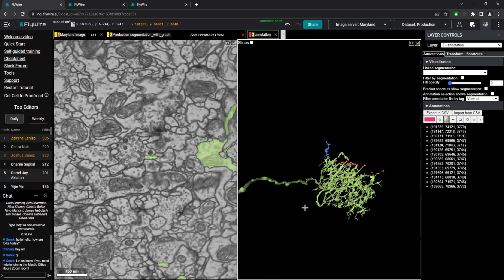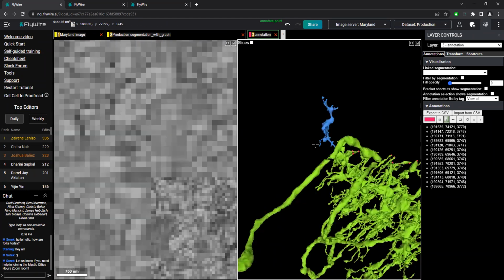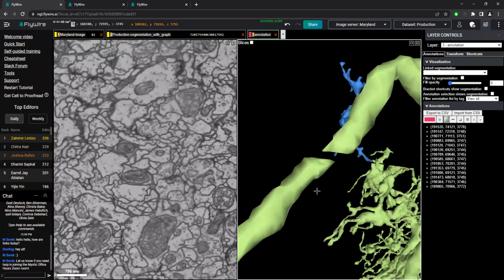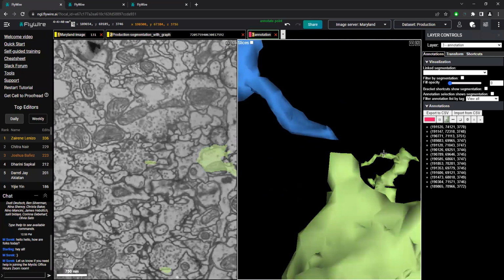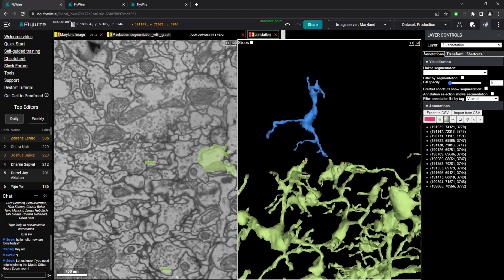And another way to look at this is if we have a continuation that we definitely know for sure is good, say, this little loop here, we can see that there's a shift, right? So anything that's added on this side will be shifted a little bit more to the left, and this side will be shifted more to the right. So if we look over here where we added our continuation, this is more to the right and the shift is over more to the left, if that gives you a clue on that.